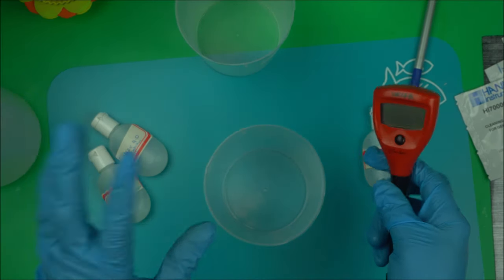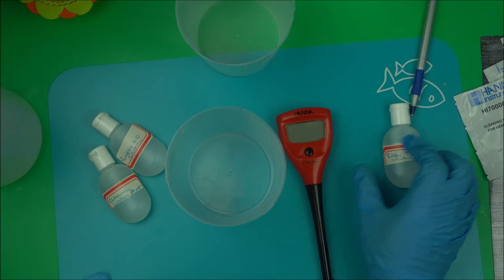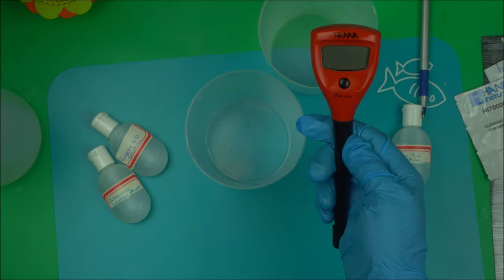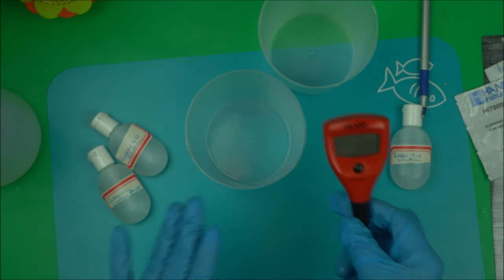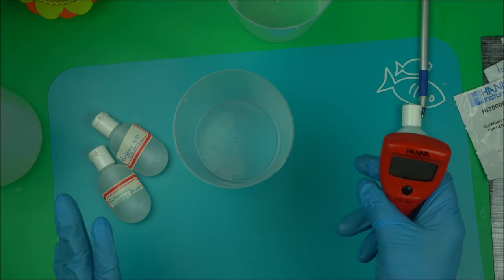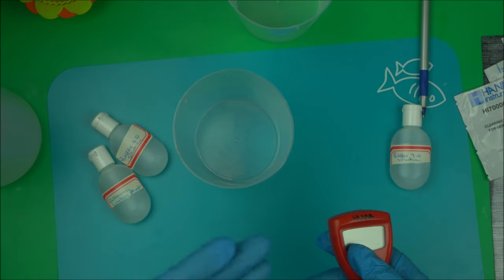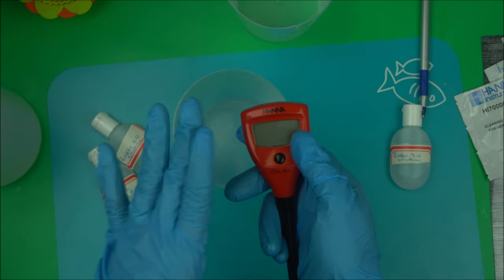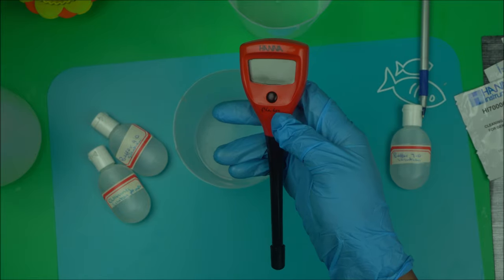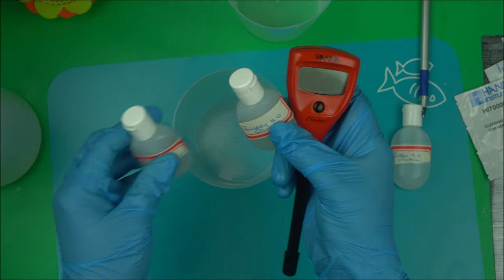If you want your pH meter to last, you have to calibrate it — that is the most important step in maintaining it. I've been using mine non-stop for a couple of months. Try to calibrate at least every week. Professionals calibrate before every production run, so if you can calibrate every day, especially if you sell skincare products, that will give you the most accurate readings.